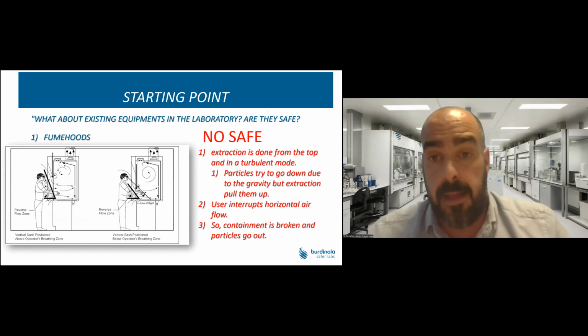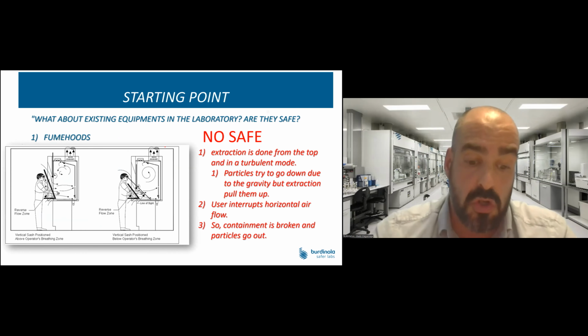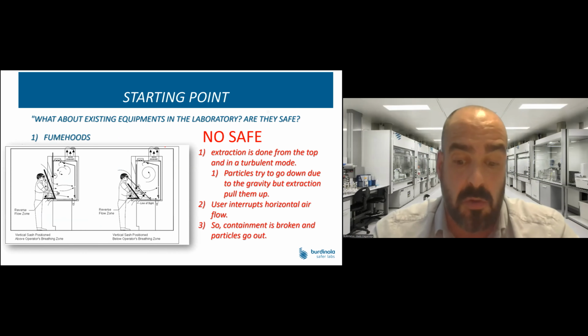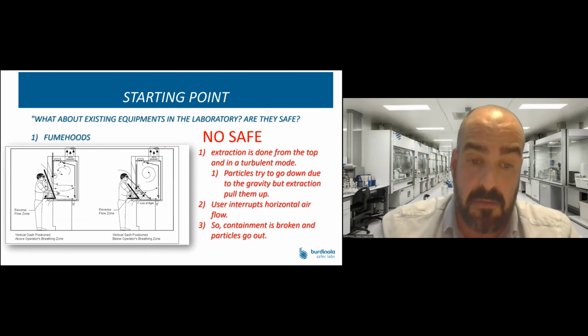And we could say the same for the fume hood. This kind of equipment is the most used for handling nanomaterials in the laboratory. And regarding safety, it's not safe at all, for the same reasons mentioned before.